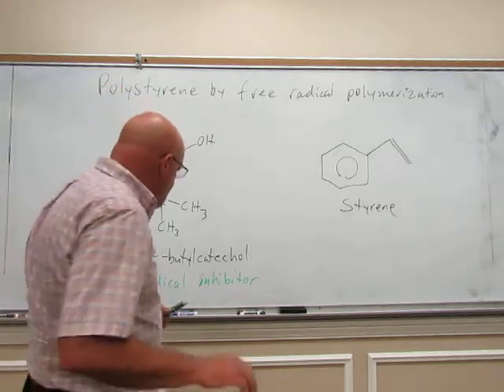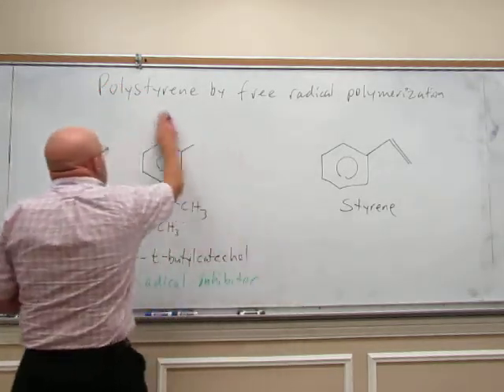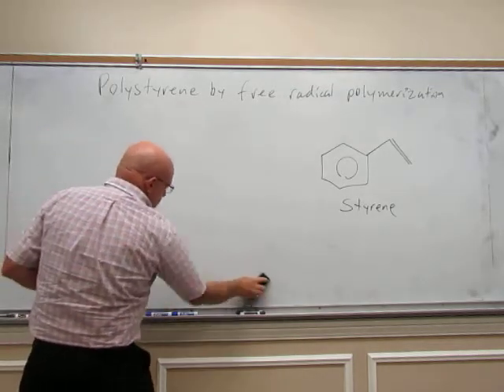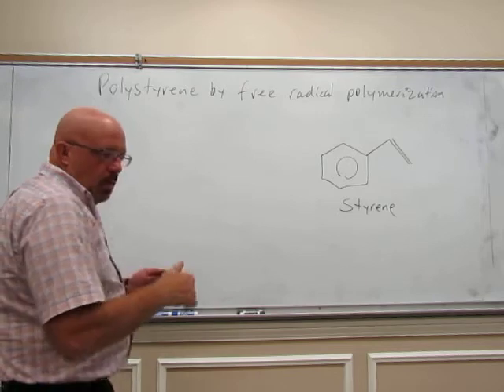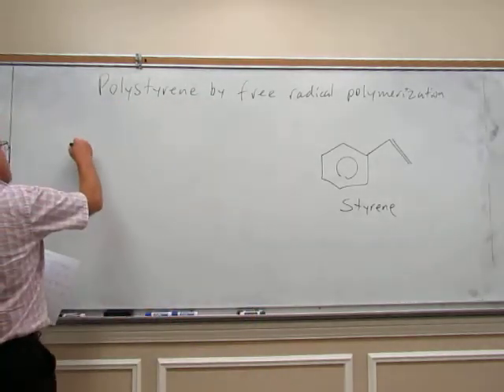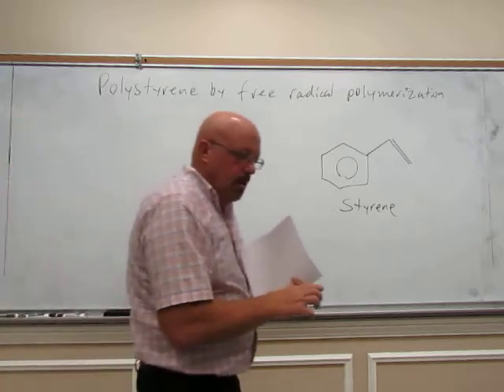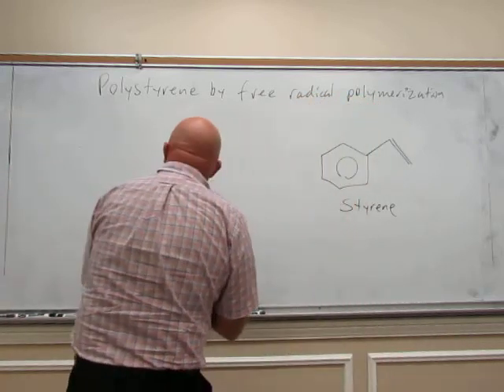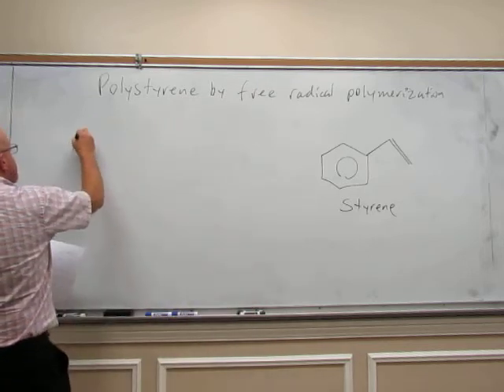Now, to do the polymerization this week, after we remove the catechol compound, we're going to be using benzoyl peroxide to generate our radicals to get us started.